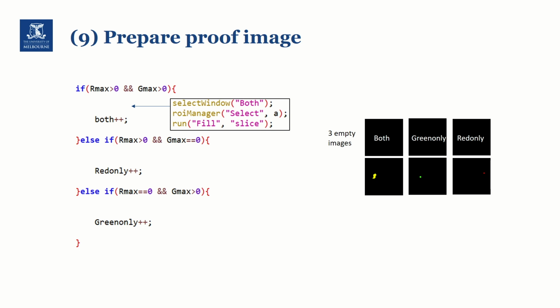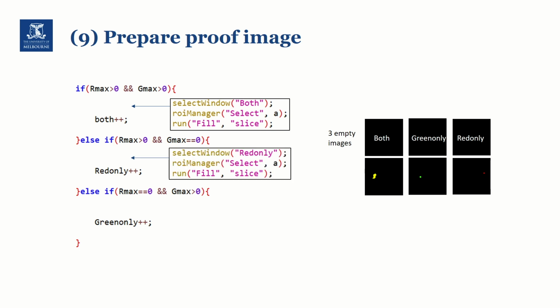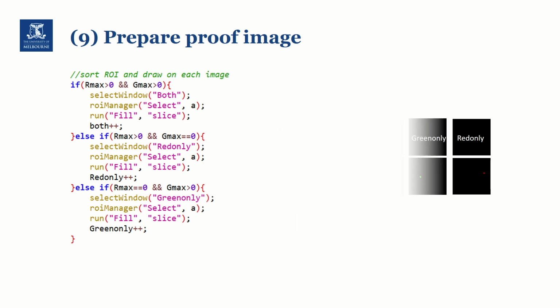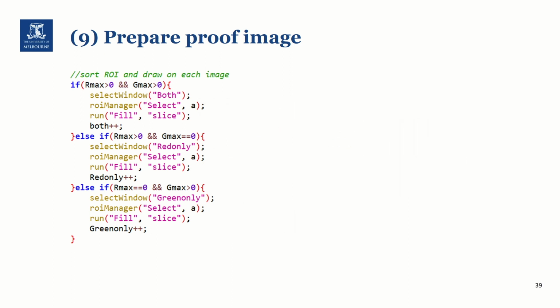And we will do the same thing for the red only and green only group. So this is the refined code.